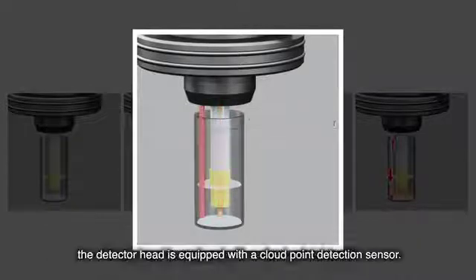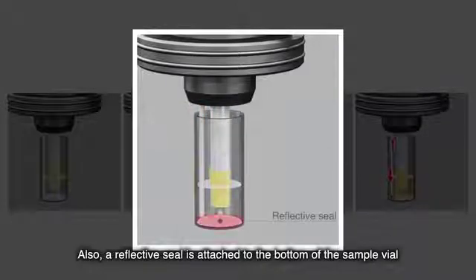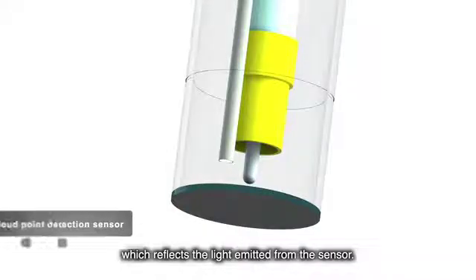Also, a reflective seal is attached to the bottom of the sample vial, which reflects the light emitted from the sensor.